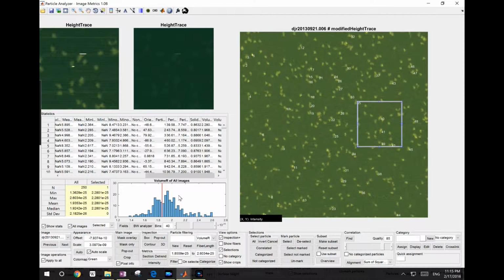You can place a lower bar, and I can also place an upper bar. The lower bar will control the text in this box. As you move the bar, you see the number changes. You can also move the upper bar. Using this manner, you can precisely determine which volume you want to cut off, the range of volume that you want to filter. Once you have done that, you can click filter, which applies the filter.